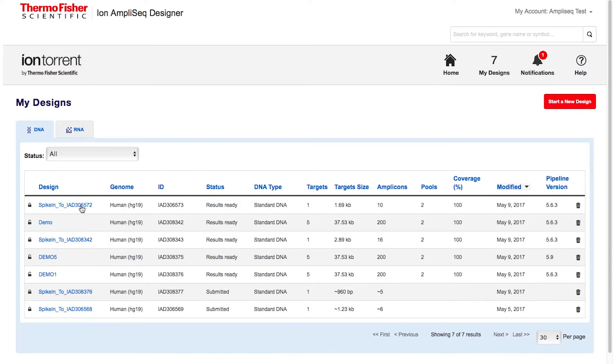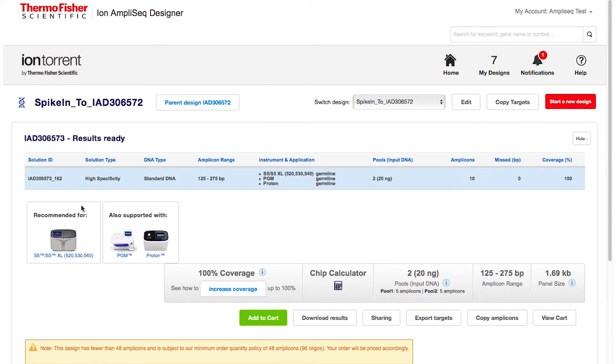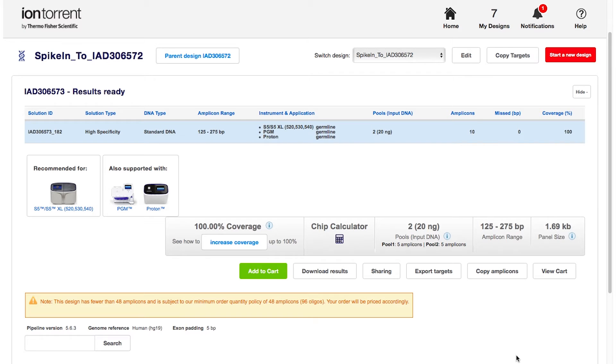Please note that if your spike-in design contains more than 123 amplicons per pool, it will no longer be considered suitable for a spike-in panel. If that's the case, reduce the size of your spike-in panel by editing and deselecting one or more genes in the red box. Once your design is suitable for spike-in, a success message will be displayed. Click the link to see your spike-in panel and complete ordering through the made-to-order custom workflow. You will receive these panels separately with detailed instructions on how to combine the two.